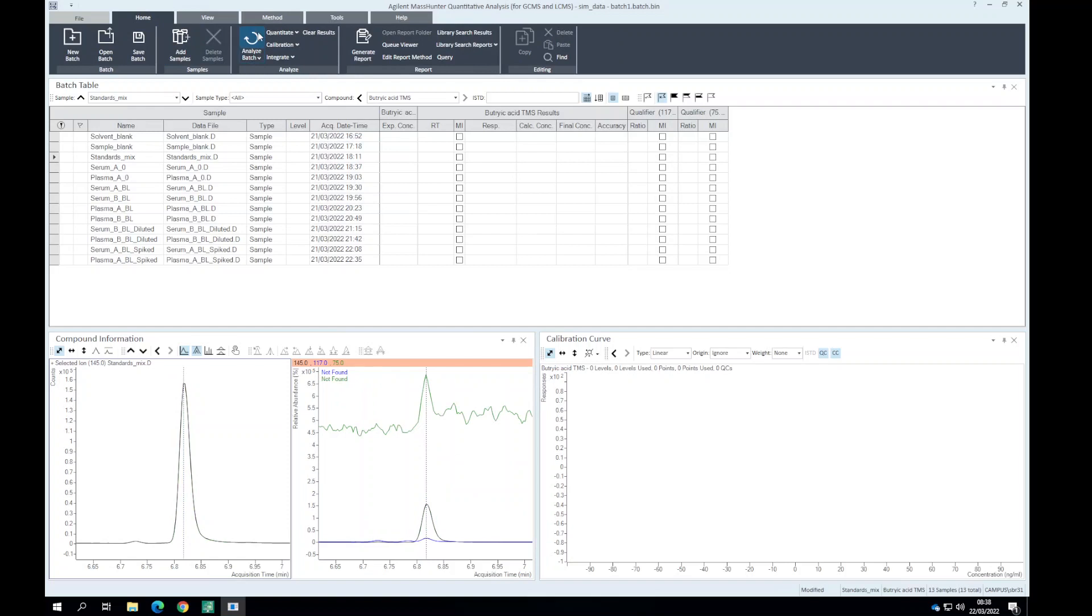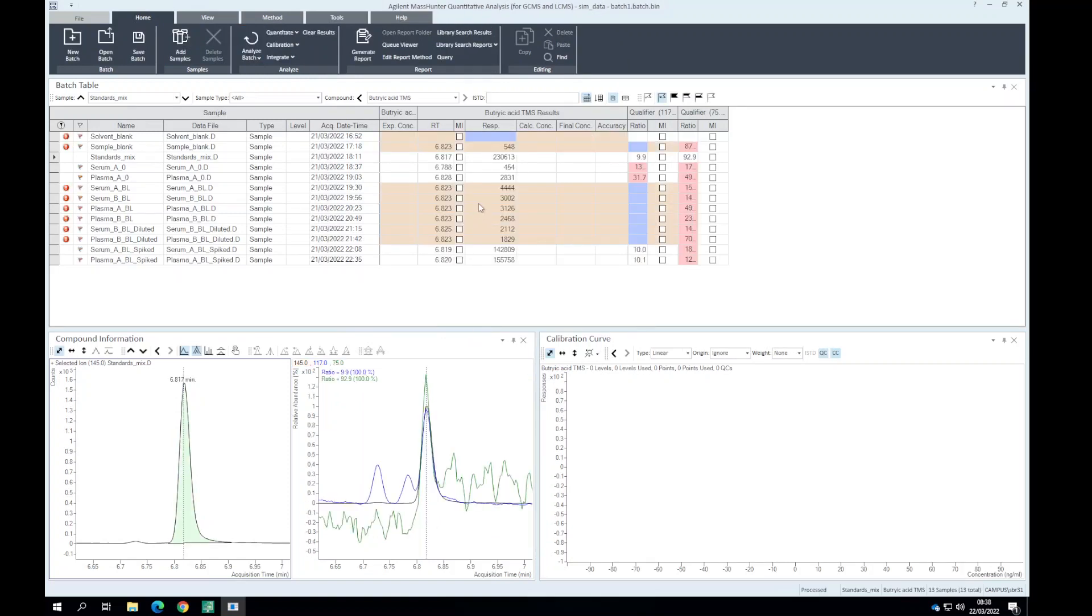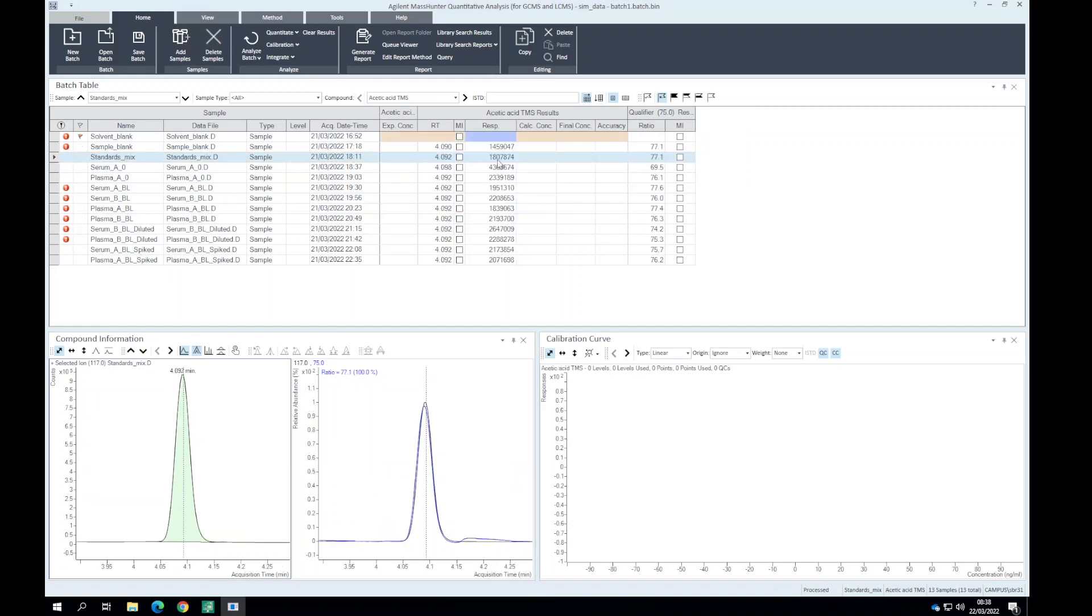We can reanalyze this batch. Now for our standard we see there's qualifier and quantifier ion ratios and that should be consistent whenever we've got a hit or a potential in our samples. Going back to acetic acid which is prominent in these samples, we can see the quantifier and qualifier ion ratios stay similar. Again, you would evaluate this with QCs throughout the batch.